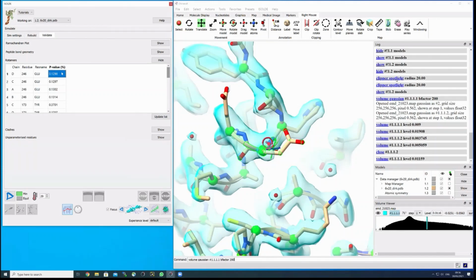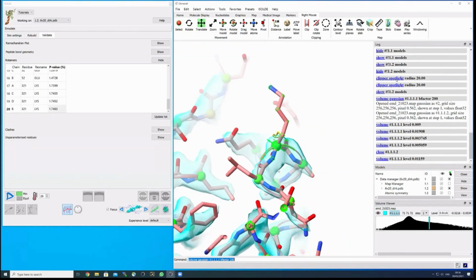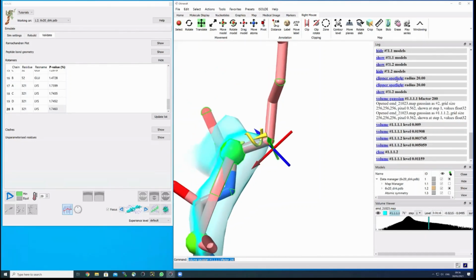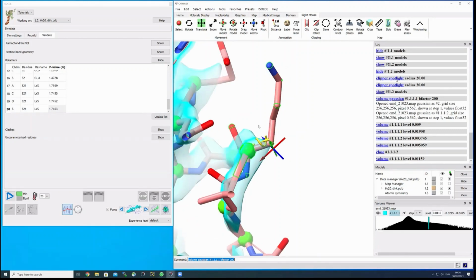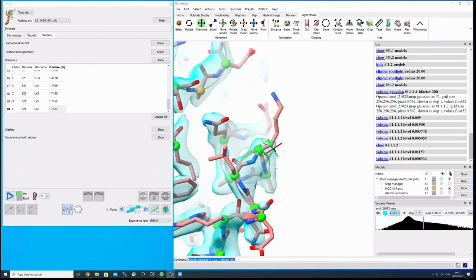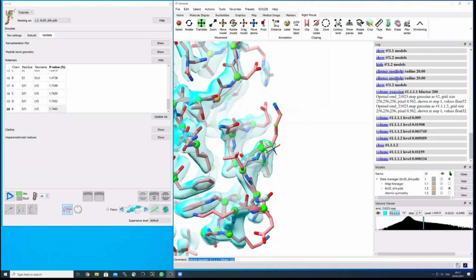And like this, you can basically work yourself through the list. The top ones here are the most dramatic outliers for the Rotamers, and if you go down the list, you see here the p-value approaches 2%. Here we have a lysine residue. You see that the color of this mark here changes to yellow, so it's not as dramatic as the big red one. Here it's the same, it's a lysine residue. It's pointing out to the surface, to the exterior.